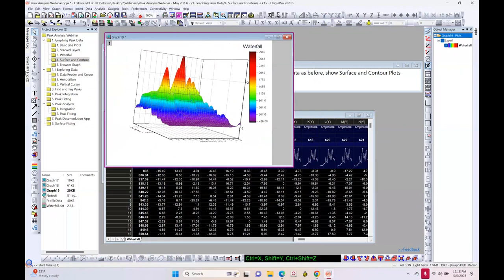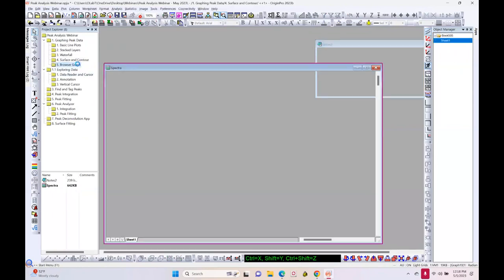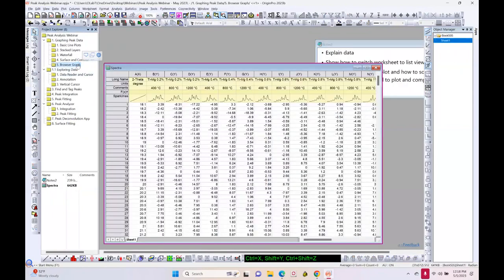One more plot type I'd like to show is called the browser graph — introduced in recent versions. Let me check the chat window quickly. My colleague is helping to answer questions.